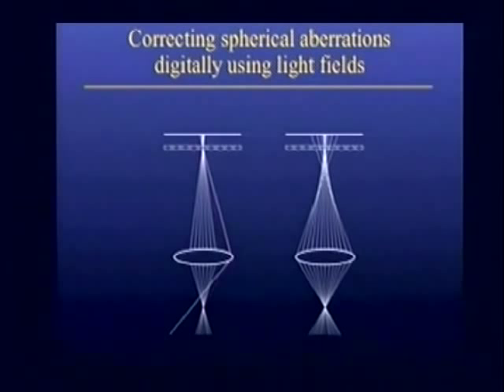So what's an aberrant situation in a microscope happens all the time. Microscope objectives are optimized either for water, whose index of refraction is 1.33, or oil, which is 1.52, but protein, which is the stuff we're made of, is maybe 1.39, 1.45, 1.47, and so microscopists are often looking at aberrant situations. And in fact, the aberrations may vary across the specimen spatially.